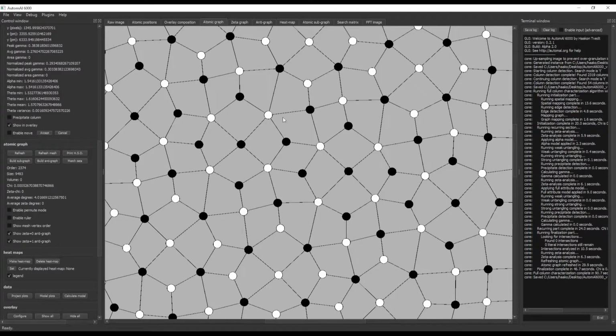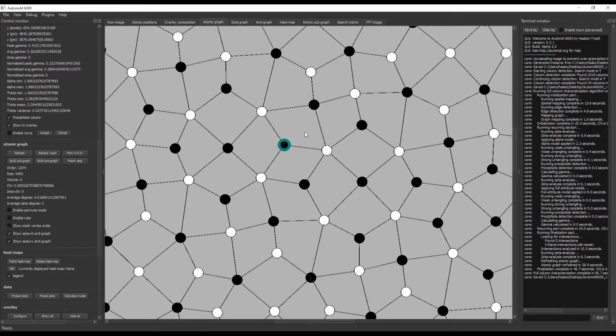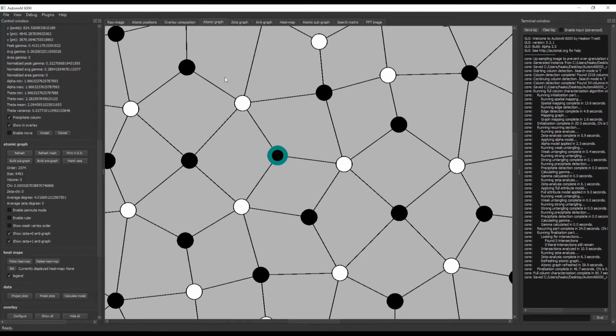A consequence of these principles, combined with the fact that there are only 2 possible heights, and this is actually a bipartite graph, is that every mesh, and by mesh I mean an area enclosed by arcs, should have 4 vertices, which means that every mesh should be 4-sided.